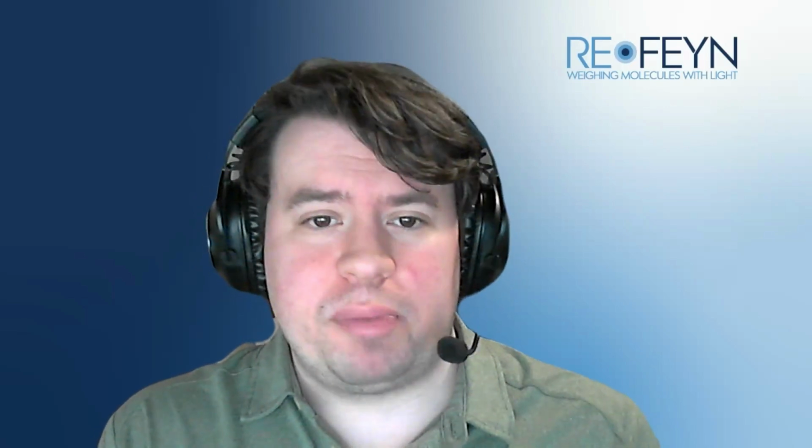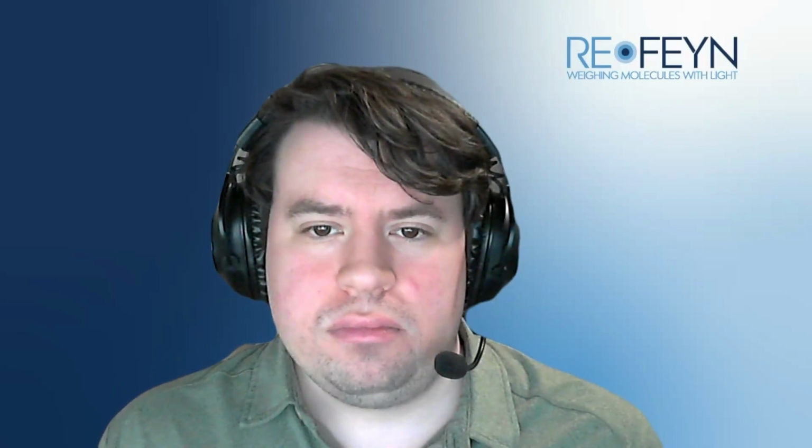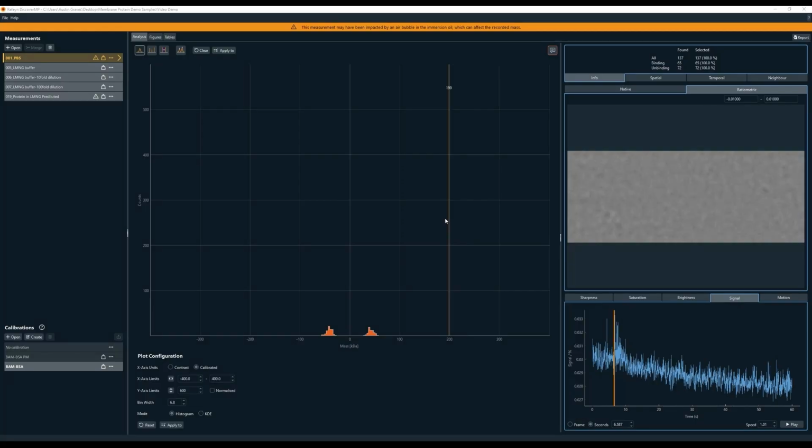Of course, it's easiest to analyze membrane proteins with mass photometry that are prepared with other mimetics like nanodiscs, peptidiscs, or SMALPs, but let's say that detergent is all you have to work with. Well, in this video, we're going to look at some membrane protein data, and I'm going to give you some tips on how to get the most out of this kind of sample. All right, let's go ahead and jump into Discover MP.